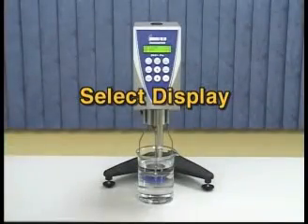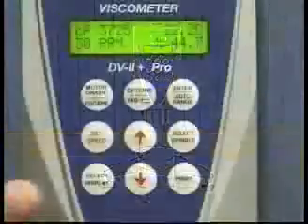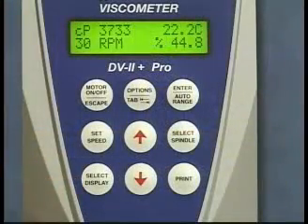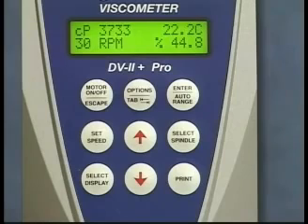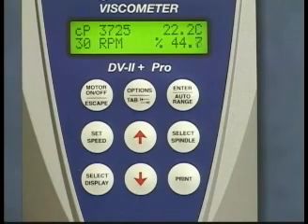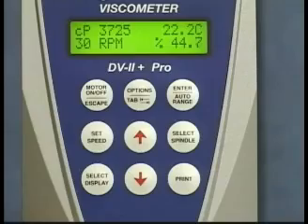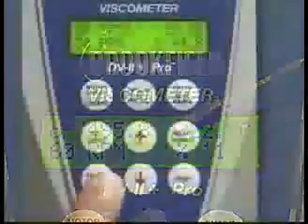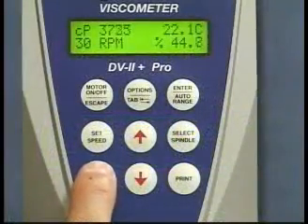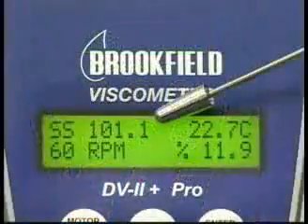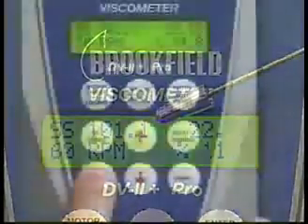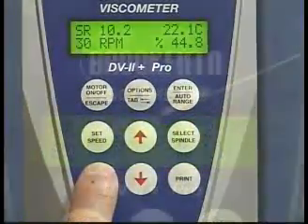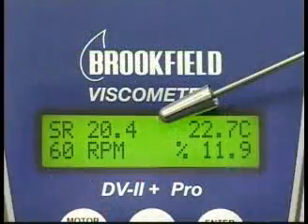Select display. The select display key allows you to choose which data parameters you want shown on the main display. You can choose to display viscosity in centipoise (shown as CP), shear stress in dynes per centimeter squared, or shear rate in reciprocal seconds.